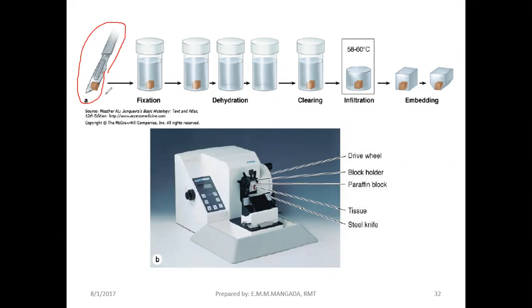Siya yung gumagawa nito. He will pick kung saang part ng tissue yung isa-sample nung organ. Hindi naman yung buo. Kukuhanan niya lang yung area na suspicious, for example, of cancer. If for example, the patient is suspected of having a cancer, parang ganun. Then after that, they're going to fix this.